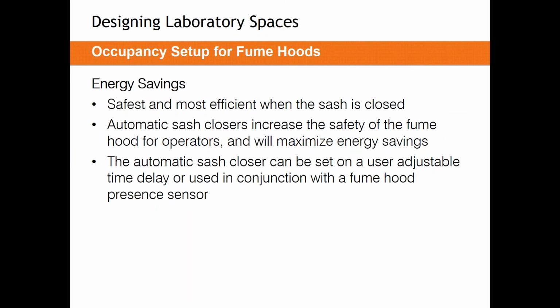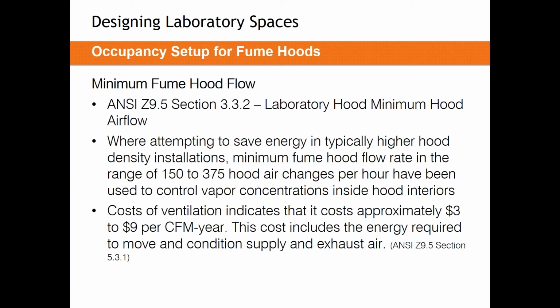The studies and the reports I've seen on these is they can pay themselves back in about 1.5 years. Standard life of a fume hood is 5, 10, or 15 years. You're going to have energy savings from that automatic sash closer after 1.5 years, and people will be kept safer. To my understanding, Title 24 in California is being updated so that fume hood dense laboratories, and it does give a definition for that, are going to require automatic sash closers going forward, just to take the question of this all out of it.